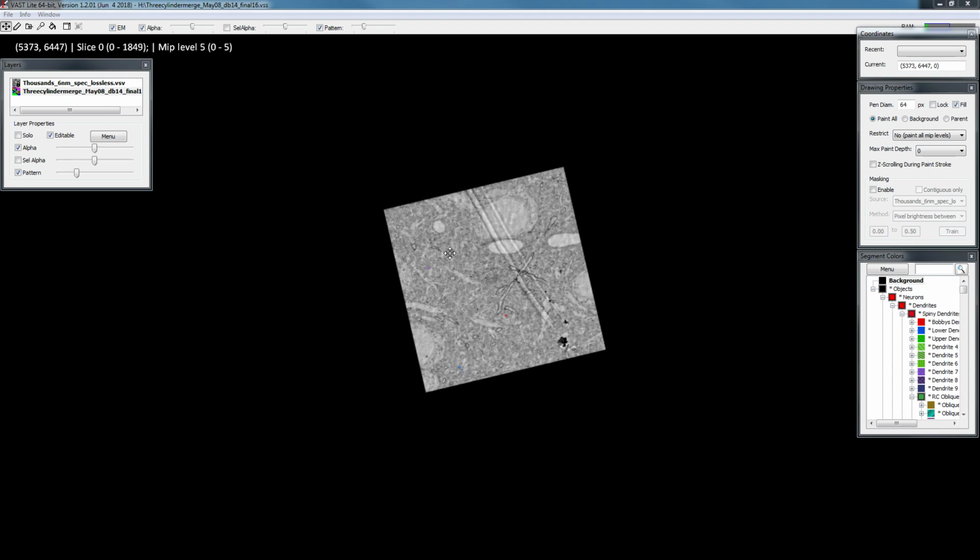In this tutorial I want to show you how you can use vasttools, a Matlab script, to export 3D models from your traced objects. The exported models can then be loaded into 3D rendering programs like Blender or 3D Studio Max. So to start up, I have loaded VAST Lite and I opened the Kasturi dataset, high resolution, which is available on the web page, and the segmentation that is also available on the web page.